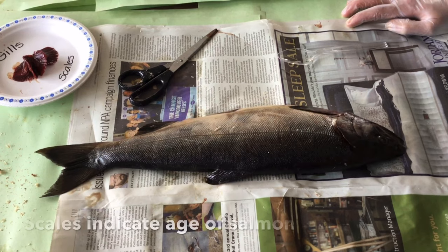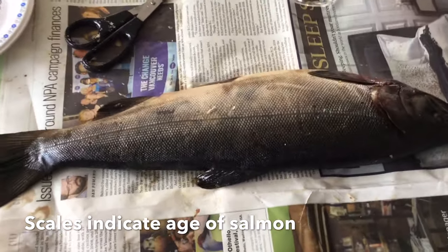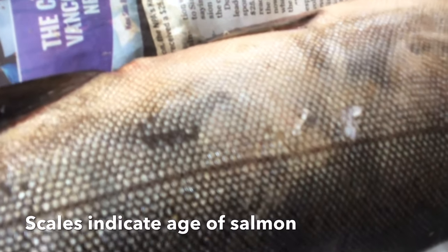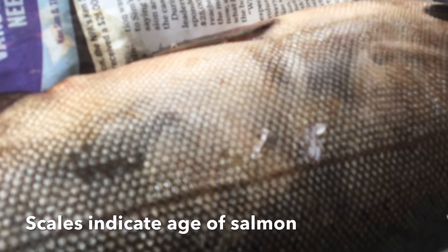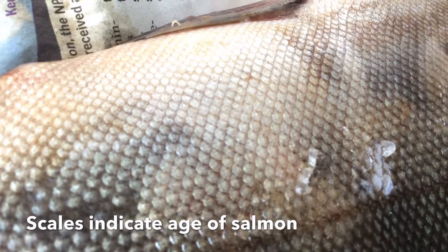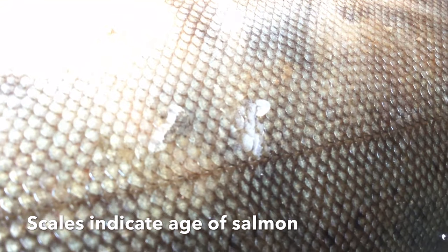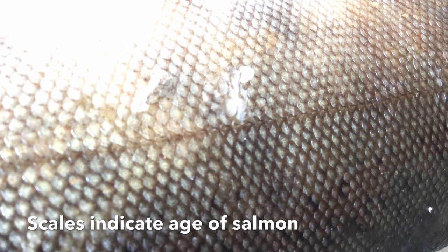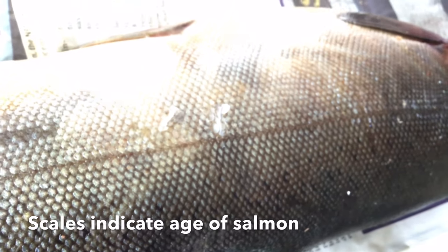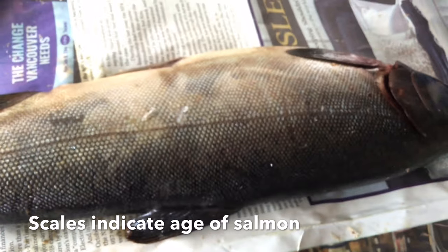Some more information about the scales. Very important: the scales grow as the salmon grows, and each scale forms lines, like the rings of a tree. But we can't tell from these tiny ones. You have a picture of a magnified scale in your booklet. Notice the way the lines are grouped. This tells you the age of the salmon. And if you look very carefully, you can see where all the lines are. Can you see in your picture how they're actually in three groups?